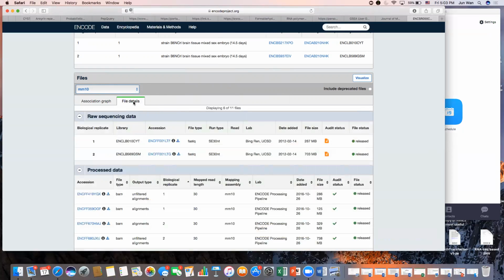Okay, so you went from data to matrix, to organism type, to tissue type. Now we're in the target, and these 2 files right here, you're going to have to download. And what I recommend that you do is to download them directly into your working directory in Karst. Okay, remember, the less you move files, the better off they are. If you take a file and put it in a Windows environment, and then back into a Linux environment, files can get mutated, changed, things can get cut off. Use your wget command in Karst.